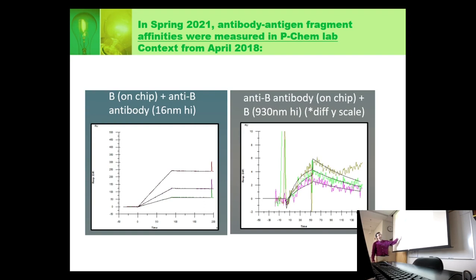This binds really well. On the other hand, if we put the antibody on the chip, we also see binding, but much lower binding. You see how this response is much lower, and the noise is big. In fact, it's hard to even see this. So we have to talk about what to do about data like this. But this is barely working, but it is still working. It's showing us that we get about the same response, a similar result. Hopefully your data will be closer to this than to that, but we will have to see how it works.